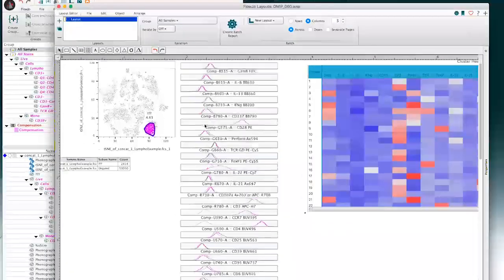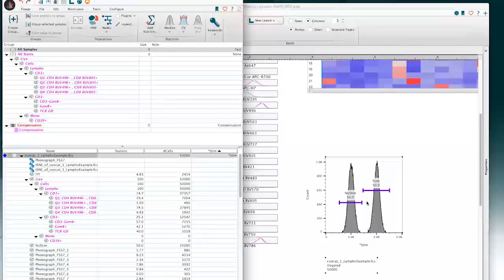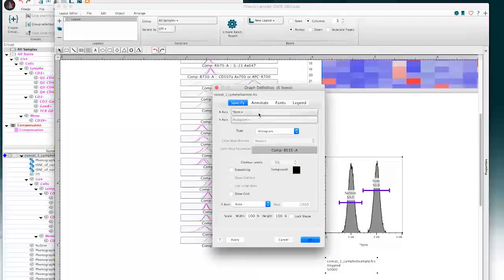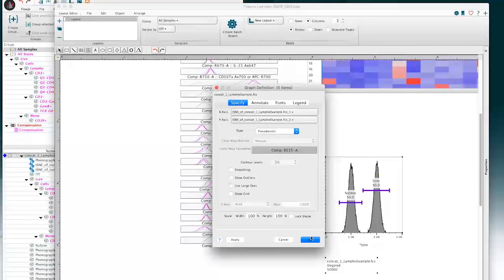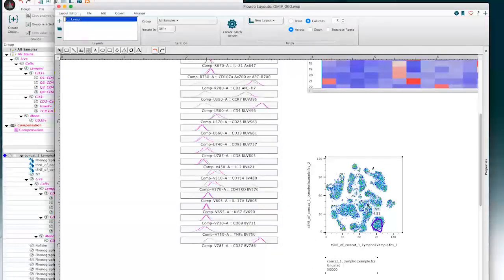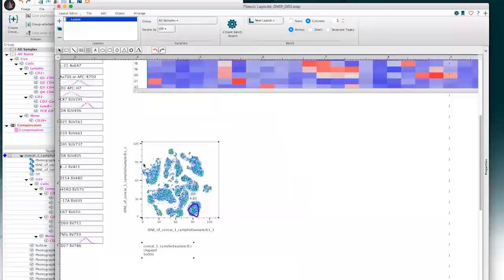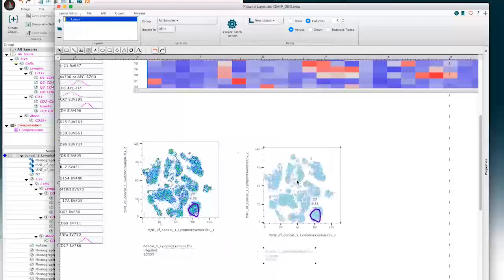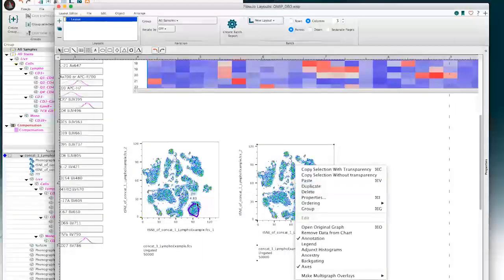Okay, so let's take the root file here. And actually, I'll show you this one. I'm going to go tSNE 1, tSNE 2 as a top plot, or as a pseudo color top plot, which is just going back to my tSNE parameters. So that's everything in the system, all cells, stim and no stim. So I'm going to duplicate this. Holding down the Option button and dragging will duplicate, or you can right click and duplicate like that.